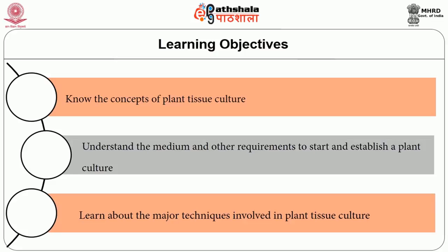After completing this module, you will be able to know the concepts of plant tissue culture, to understand the medium and other requirements to start and establish a plant culture, and to learn about the major techniques involved in plant tissue culture. This module is presented to give an overview of the definition and concepts involved in plant tissue culture, its major types, and the basic techniques involved in propagating plant cells in vitro.